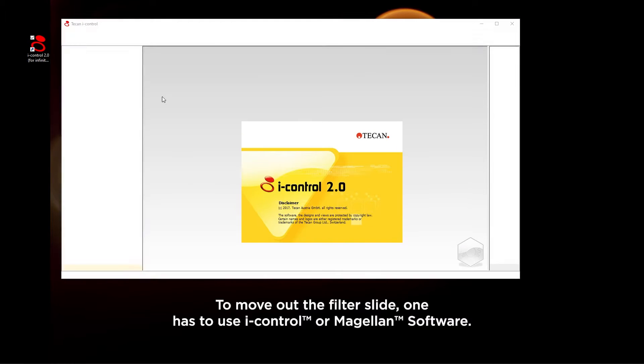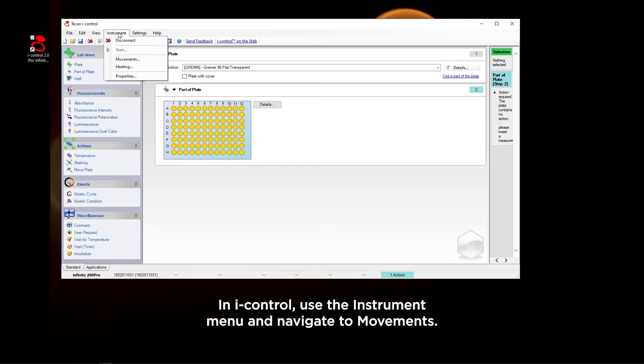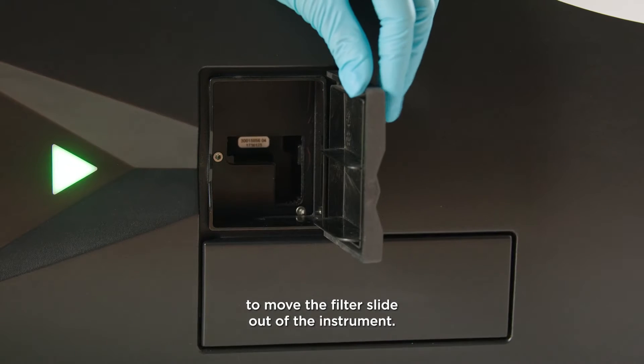To move out the filter slide, one has to use iControl or Magellan software. In iControl, use the instrument menu and navigate to Movements. Then use the Filter Out button to move the filter slide out of the instrument.